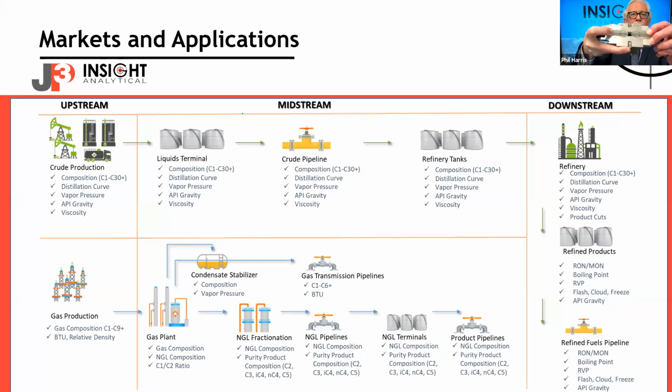Okay, so this is the flow cell. You see it's 316 stainless steel. It has a half inch port running in through the bottom. Depending on whether it's gas or liquid, we will change the direction of flow, but flow is going through the cell. Large diameter, so it doesn't plug off easily. Synthetic sapphire rods that are crystal clear, as you can see. The advantage of sapphire is it transmits infrared light well, and it's also the second hardest thing next to diamond.